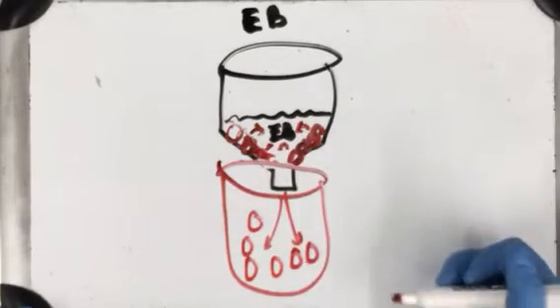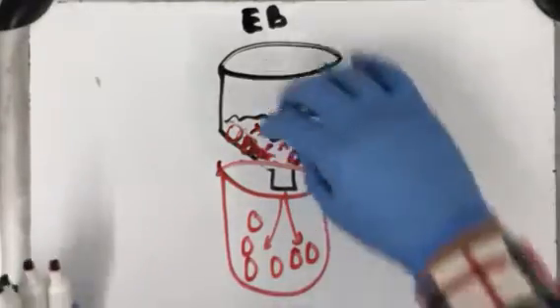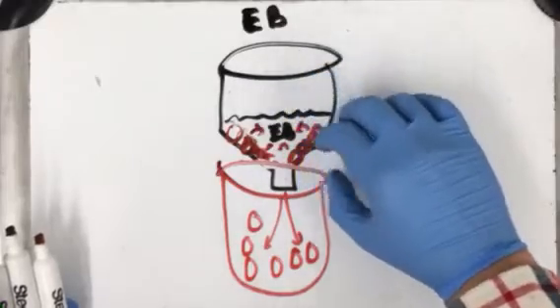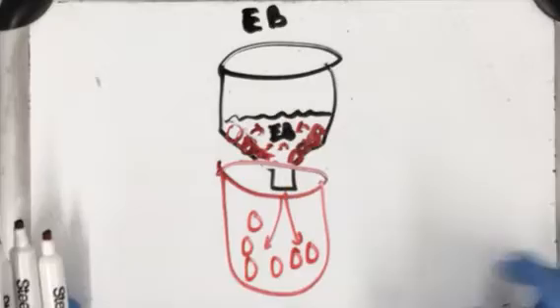And so this is how we took the plasmid from inside the bacteria cell. We broke that up, and then we hooked it to the spin column, washed it a couple times, and then unhooked it from the spin column, and now we have pure plasmid here.